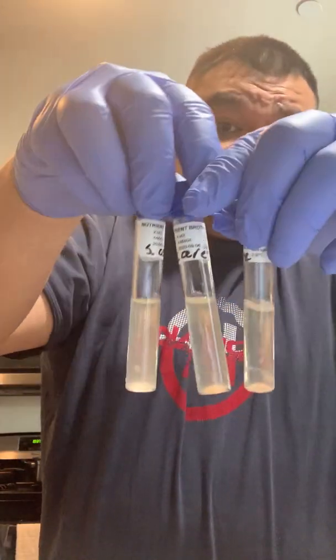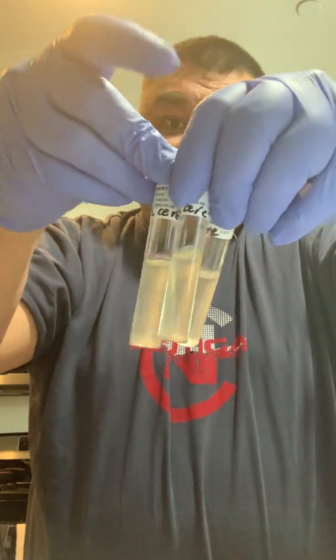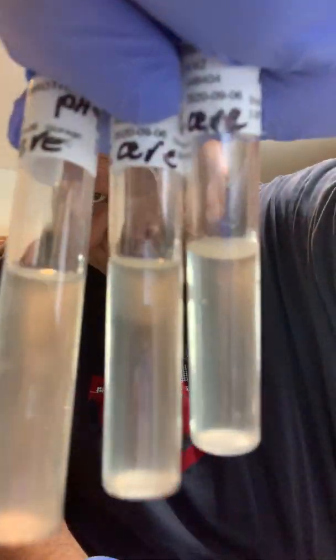In regards to that, cerevisiae broth shows clear broth but no change in color. As you could tell, this is pH of 5, 7, and 9, and they all look the same. It would have been nice if there was some kind of color change so we could differentiate if they're more acidic or alkalotic, or what type of pH they would be, more respiratory or metabolic in regards to pH changes in the body.